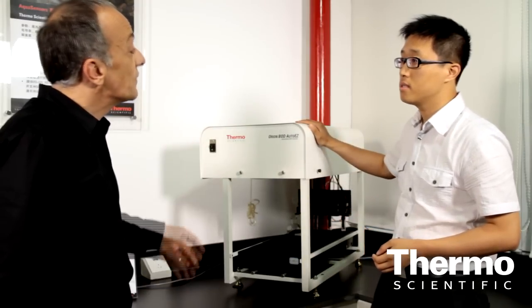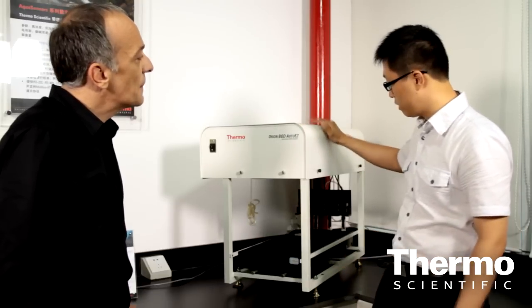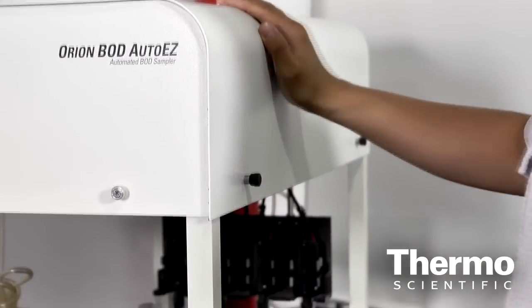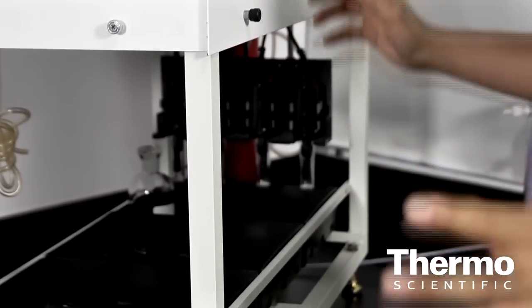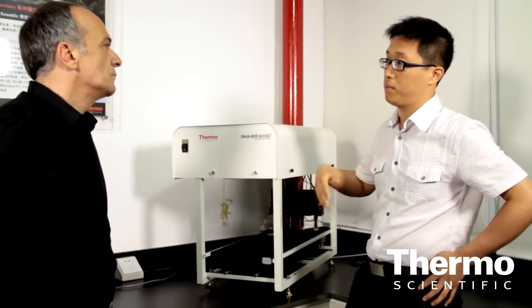Talk about the applications that this is really excellent for. Due to its very high level of automation and high volume processing capacity, it is ideal for customers with relatively high sample volumes, such as sewage companies and businesses monitored by environmental authorities.